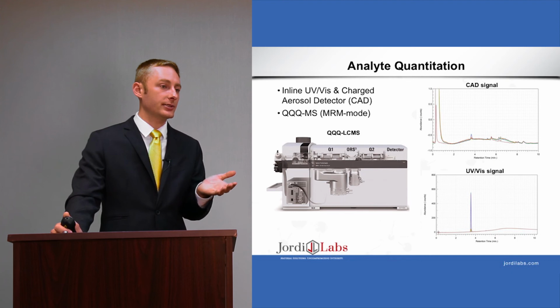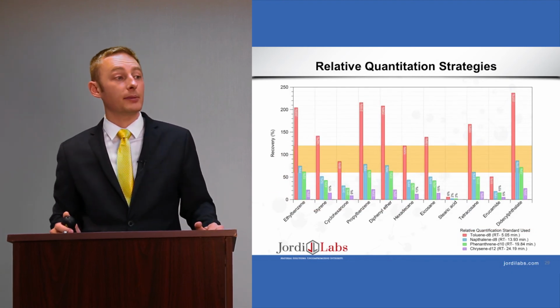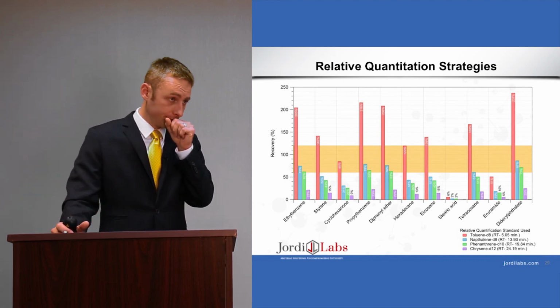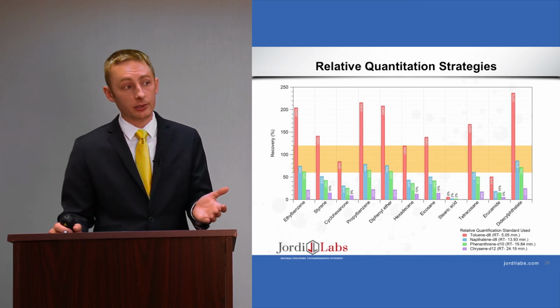Here's a trace of a CAD signal and a UV-vis signal that came out of the same instrument at the same time, and we're able to quantitate each of the components that you're seeing there. Those different quantitations were conducted in this particular case using a relative quantitation strategy.